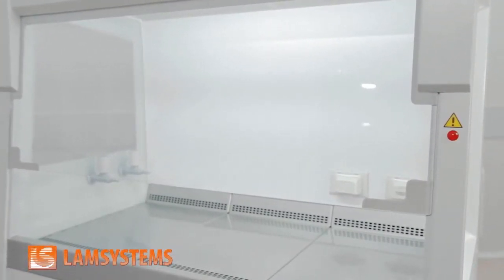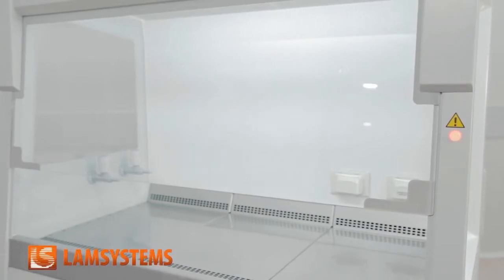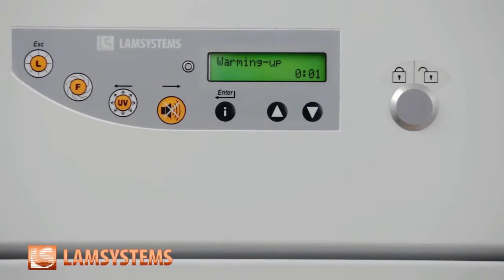After that, the cabinet automatically goes to the operating mode. The maximum preparation time is 12 minutes. You can see a countdown on the display.